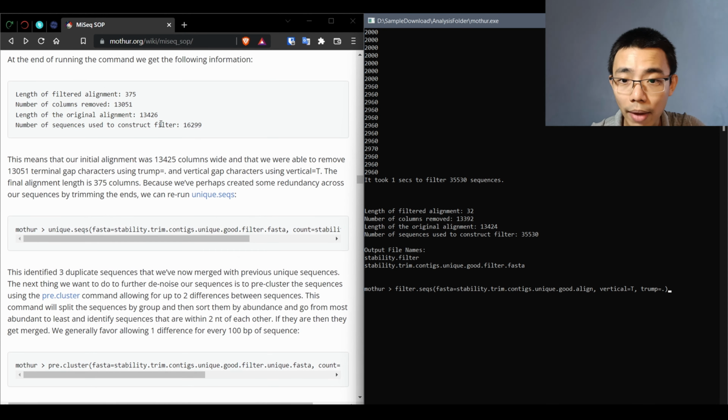So in this case, we're going to do a remove.lineage to remove our host genome or other environmental contamination such as mitochondria and chloroplasts, which have very similar 16S sequences to certain bacterial populations. Once we're done with that, we're finally going to run our summary.tax, and we can have a look at how many sequences we have and all of the different information at the current moment.